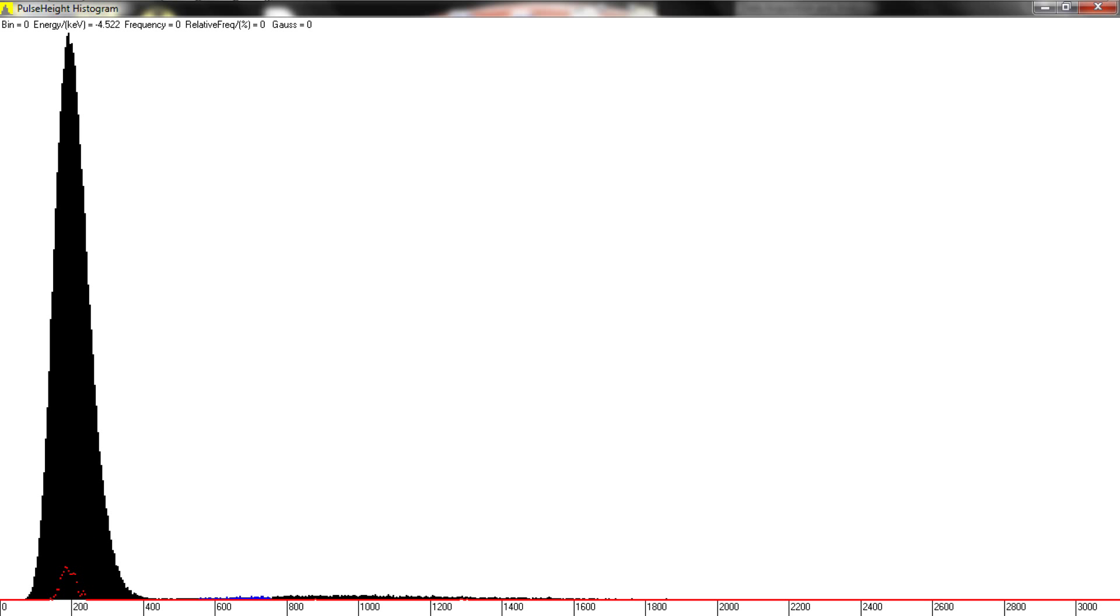So, notice how it shifted over to the left a little bit. I used water to actually block some of the lead x-ray fluorescence. And now, here's the actual final cleaned up spectrum.